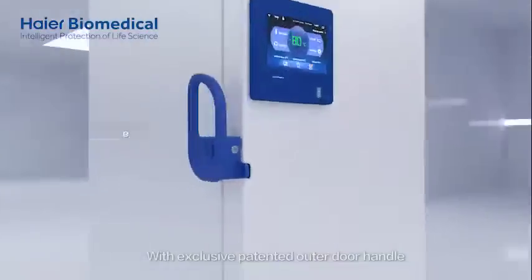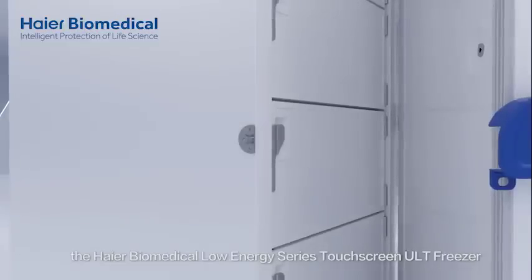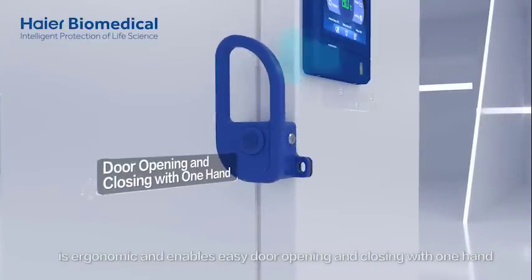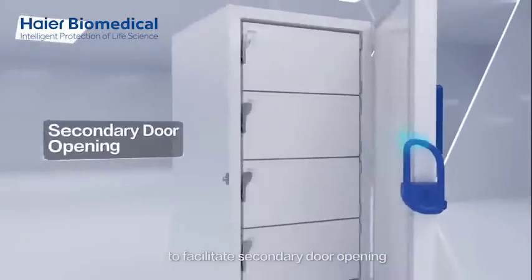With an exclusive patented outer door handle, the HIYAR Biomedical Low Energy Series Touchscreen ULT Freezer is ergonomic and enables easy door opening and closing with one hand. Meanwhile, it is equipped with a full automatic vacuum balance valve to facilitate secondary door opening.